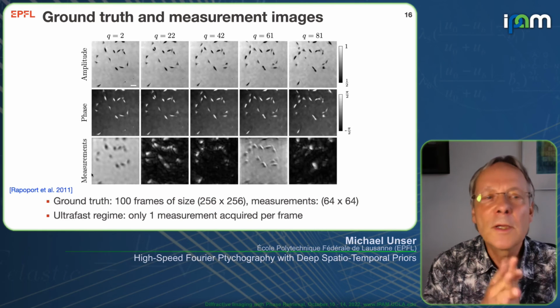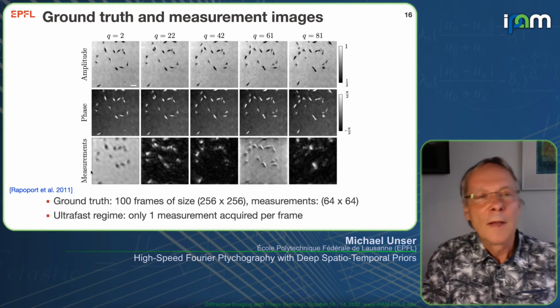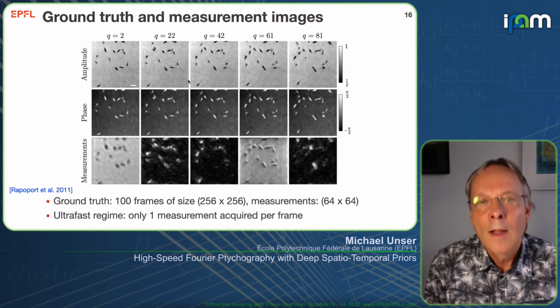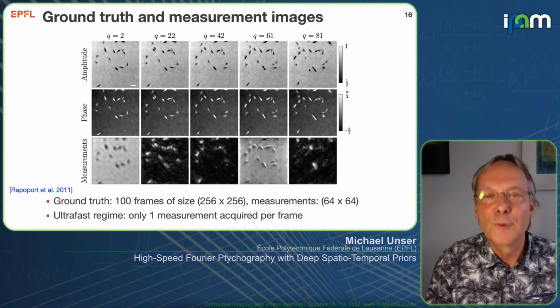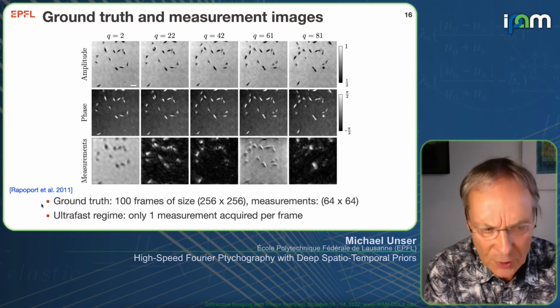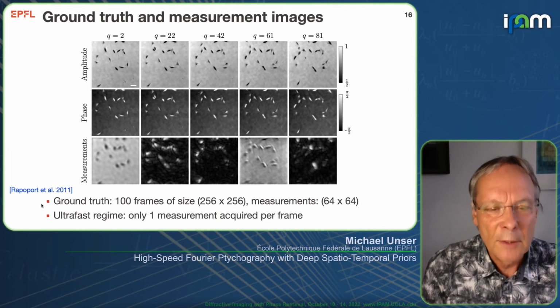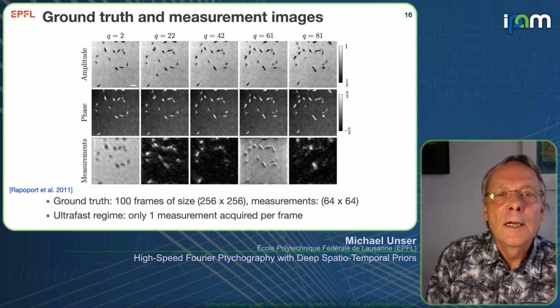Okay, so here are some examples of ground truth. The ground truths are actually what we fabricated, but using some real data. The real data comes from a tracking challenge, I think that was given at the ISBI conference.